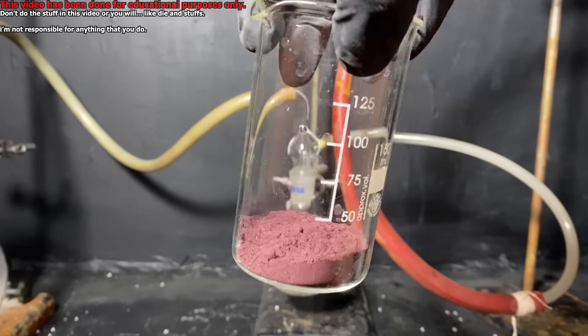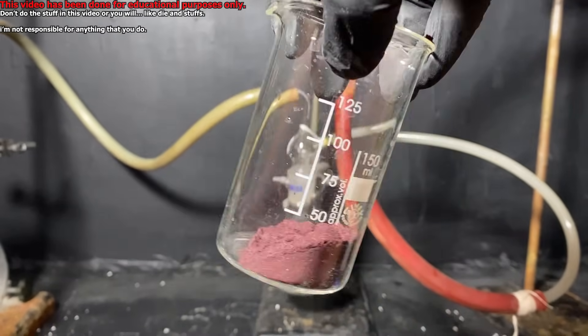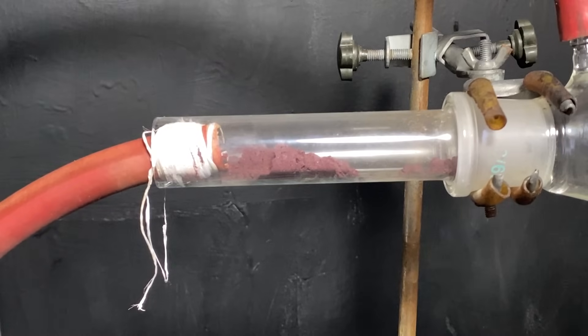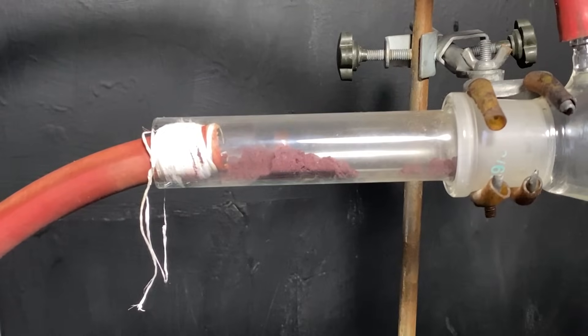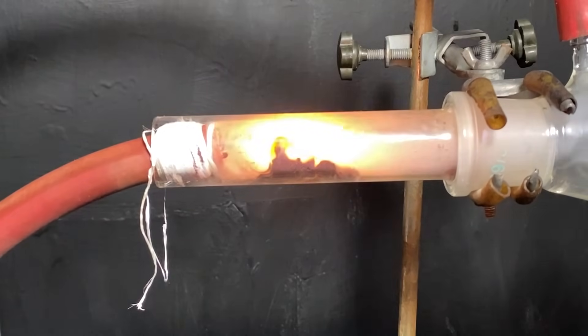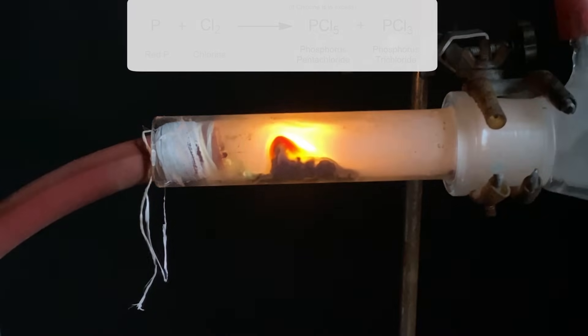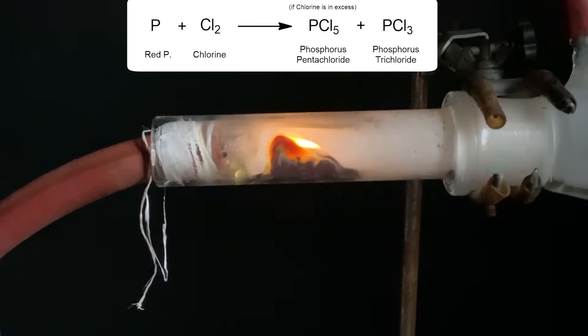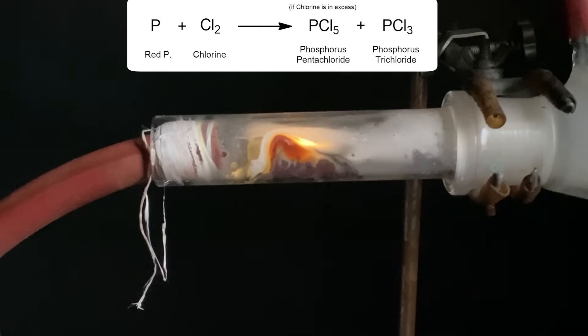Here you can see me weighing out some red phosphorus, and damn, it actually looks really nice when it's pure. The red phosphorus was put into a glass tube, and I've turned on the chlorine gas generator. Immediately, once the red phosphorus touches the stream of chlorine, a reaction happens where red phosphorus combusts in a chlorine atmosphere to form phosphorus pentachloride, which is the mist that is collecting in the flask.